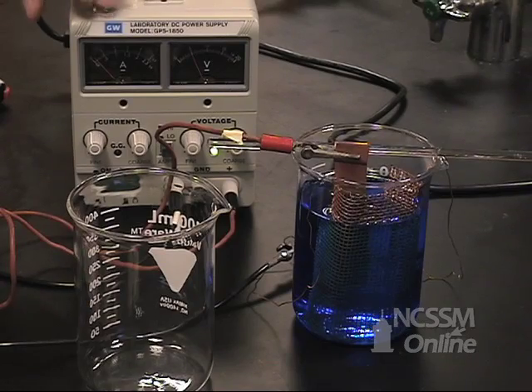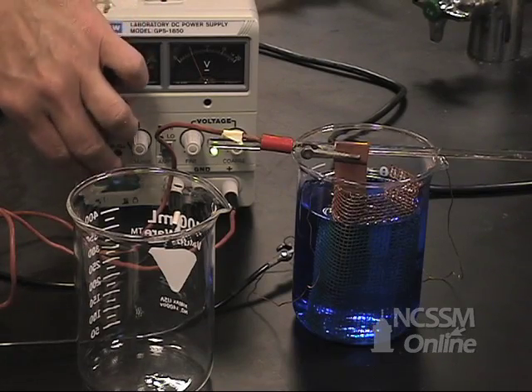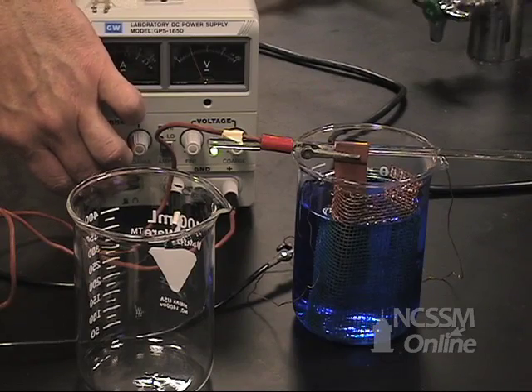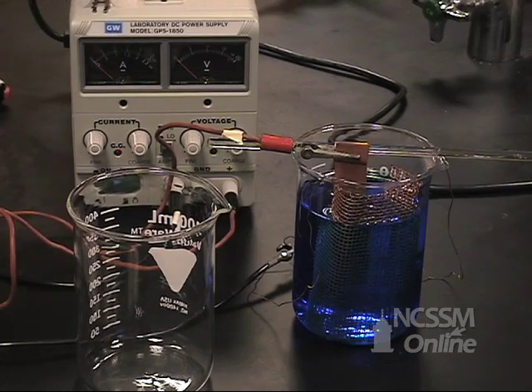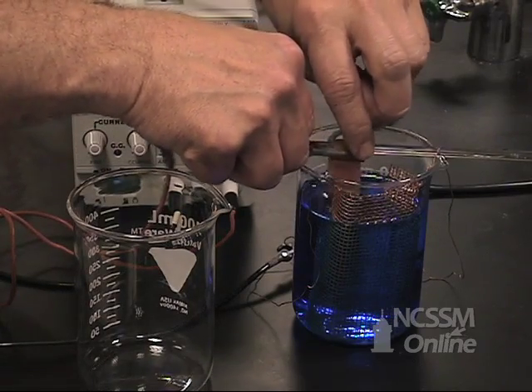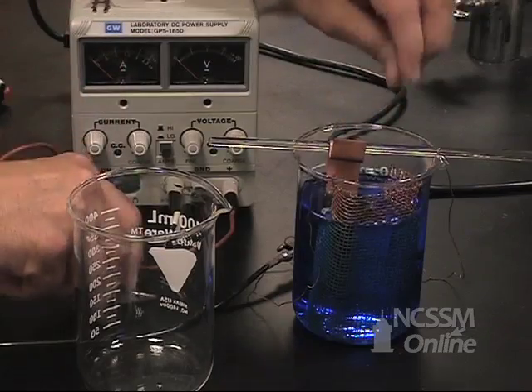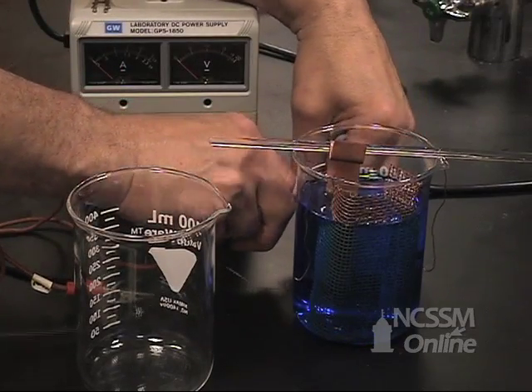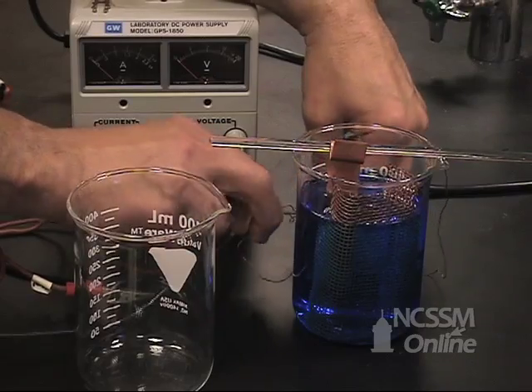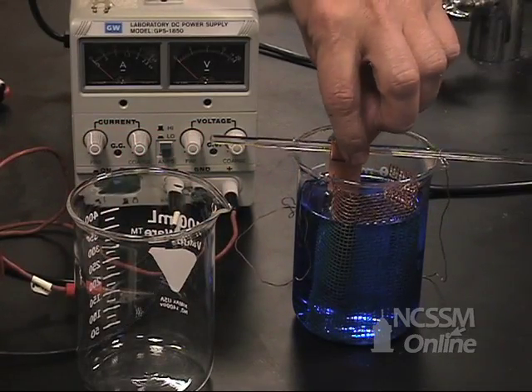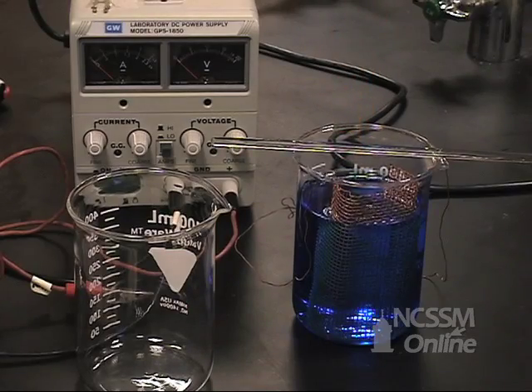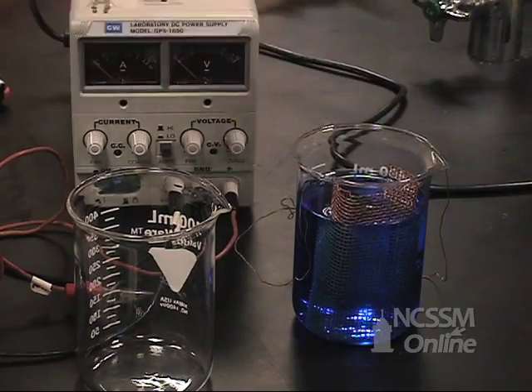After a period of time, we'll stop the experiment and our stopwatch. We'll have read the current from our power supply and the time from our stopwatch. We'll disconnect our leads. We'll remove the anode and the stirring rod.